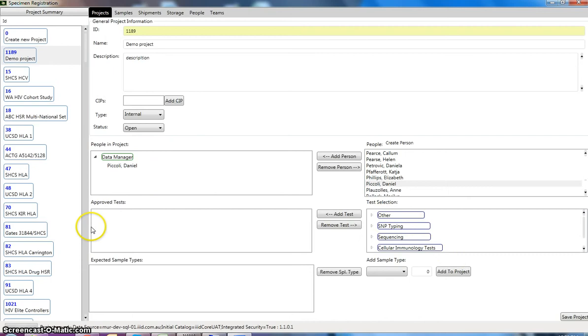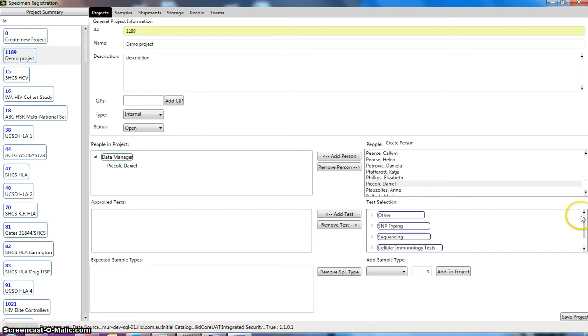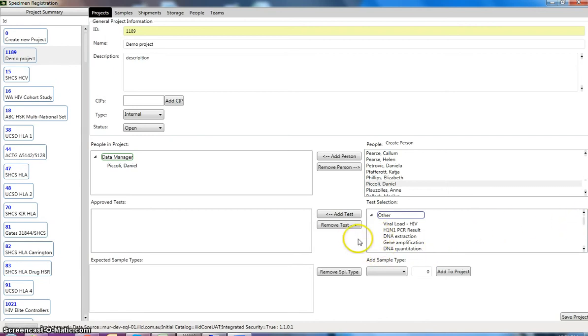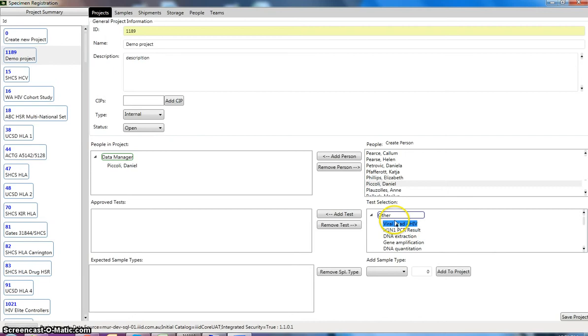The next part down here is defining what we're actually going to do in this project. This is optional. So if you want to fill it out, you can choose from our predefined tests as to what tests are going to be performed on the samples that we will eventually receive. So we can put in something like any kind of test and add that to our project.